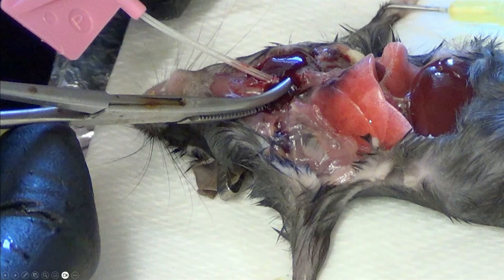Once you have inflated the lung, so you will inject the agar into the trachea, and it will inflate the lung. As you can see, this is nice inflation, and you want to see this type of expansion of the lung where the tips come out and they become very visible and prominent. You see nice tips here, and that means you've filled the entire lung with agar and filled it thoroughly.